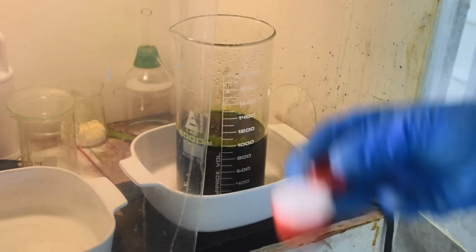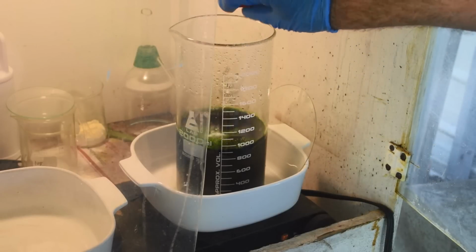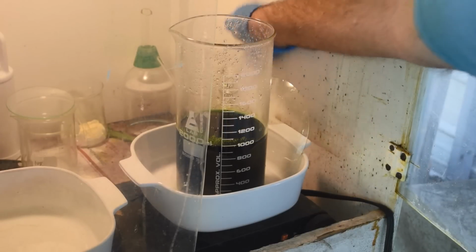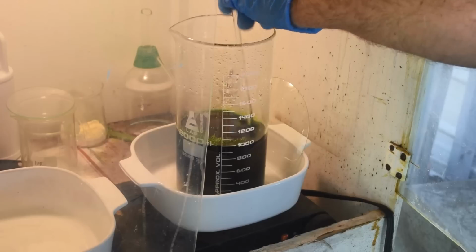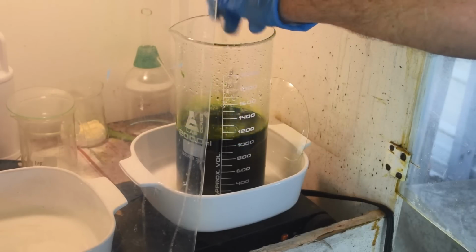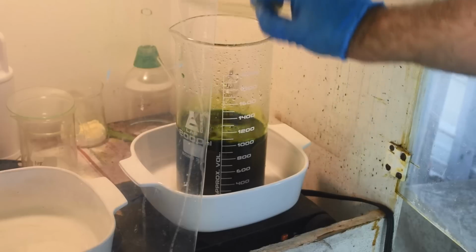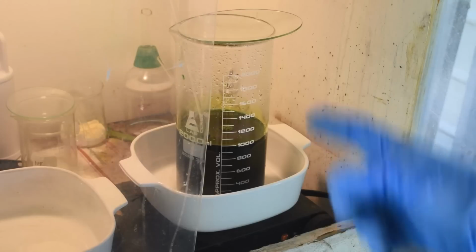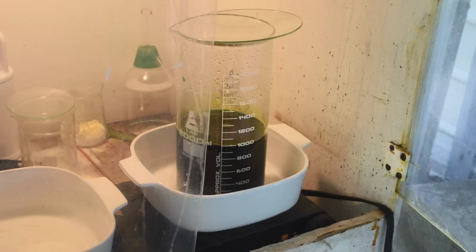Start with 3 good scoops here. It'll probably take more than that, especially as the liquid warms up. But we'll start with 3 good scoops. See if we can get all that dissolved. I'll put some more in. And then once that's all dissolved, we'll go to the next step. Let me get back over here to the filtration while I'm waiting for this to warm up and the ammonium chloride to dissolve.